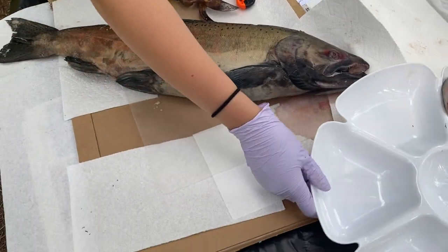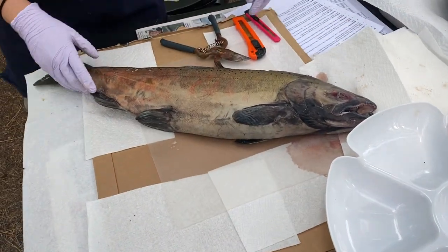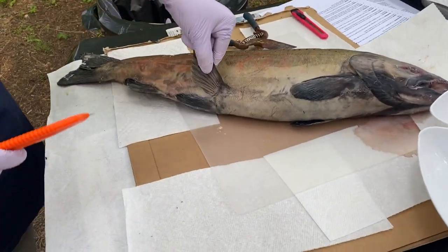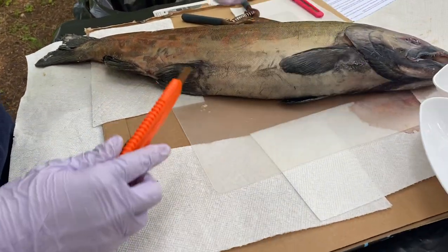So now we'll go into the internal anatomy of the salmon. And like I said before, I'm going to cut from the vent in between the fins all the way up.